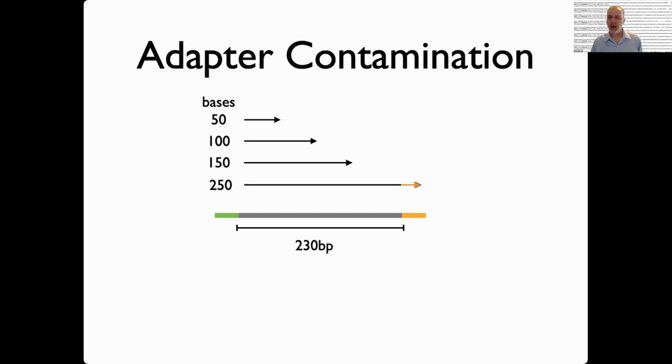So the question: why not just replace the low quality bases with N? The 3' sequence of low quality base may have high quality and still be aligned to the reference. So it is true that replacing low quality bases with N is not a totally unreasonable strategy in some situations.